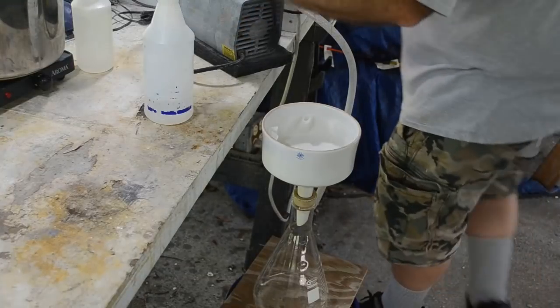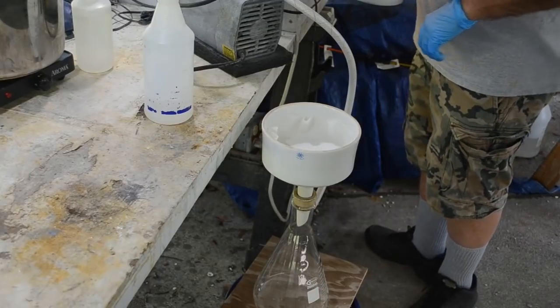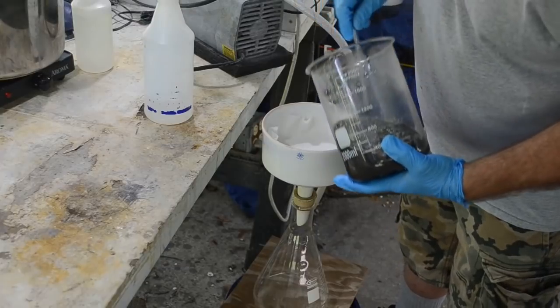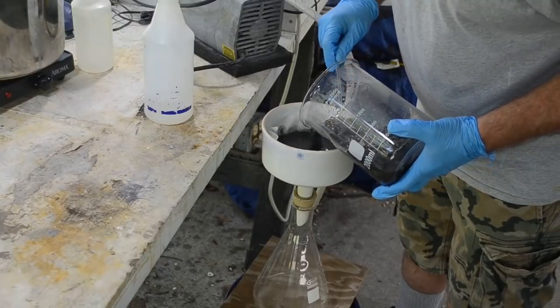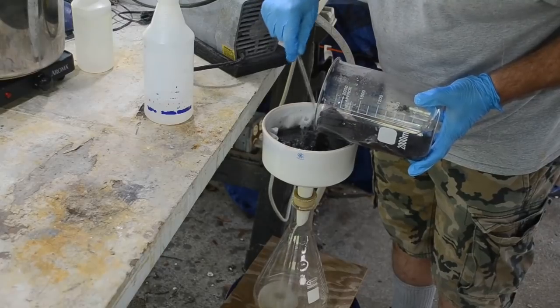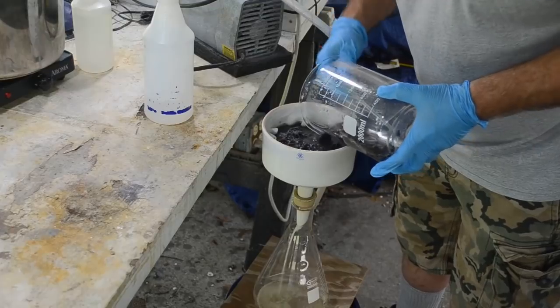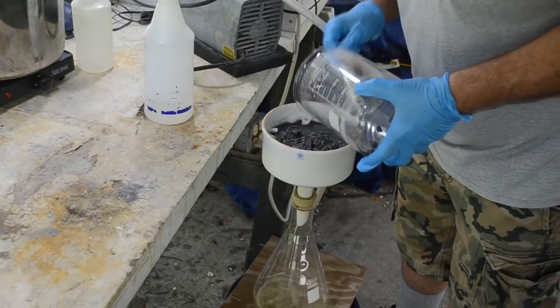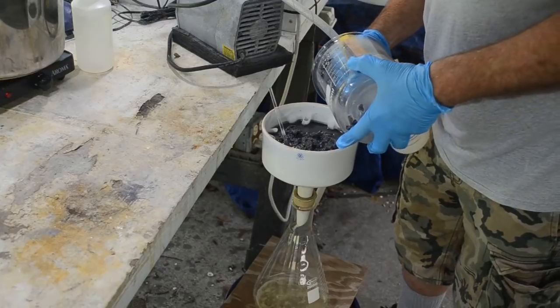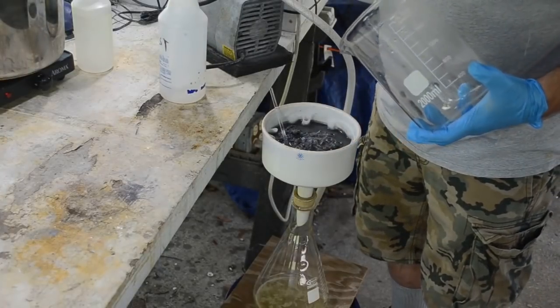All right, let me get the pump running. There's a lot of filtration involved with this, at least the way I do it. There may be ways to streamline things. Just don't cut too many corners. Yeah, I gotta get all this paper pulp in here. Yeah, liquid's coming off clear, that's good. All this stuff into the funnel, it's in the beaker.